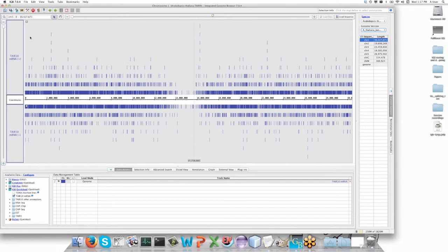You'll be able to select the one you want. If none of that is good enough for you, you can always create your own by dragging your files in and choosing the reference sequence you'd like. But since we're doing this as a quick start, literally most people can just click straight on one of those pictures and get to the information they want. So next, how do you get your file to open up in IGBI? There are three different methods.